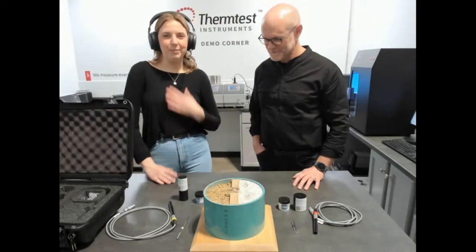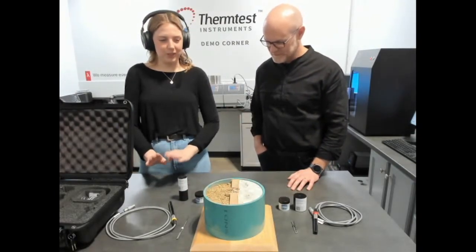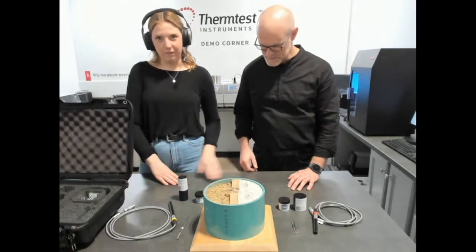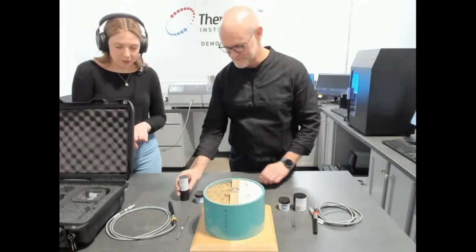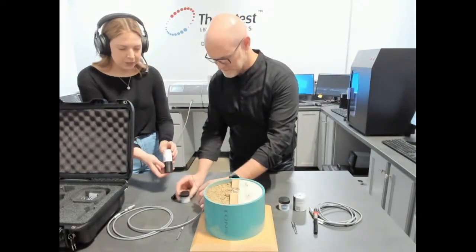Hi, welcome to the demonstration corner. I'm Kelsey and this is Dale. Today we're going to be showing you how to make some basic measurements with the TLS 100 and the TLS 150. We're going to start with the TLS 100 and show you how to make a measurement with a basic solid polymer sample.